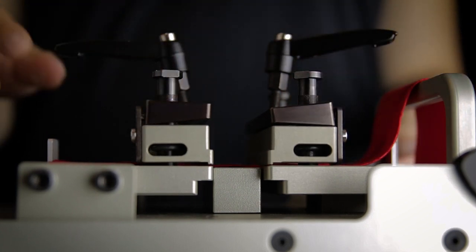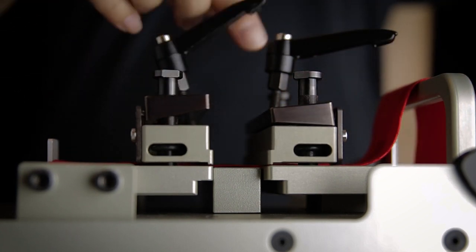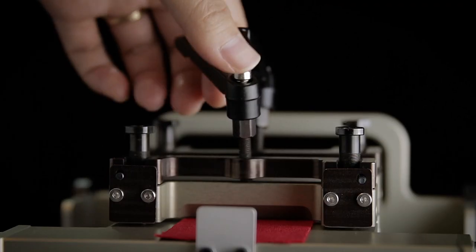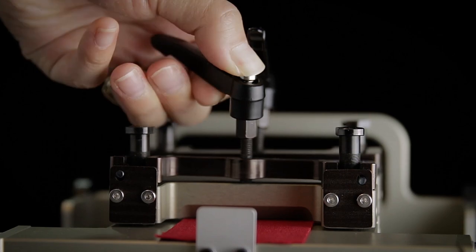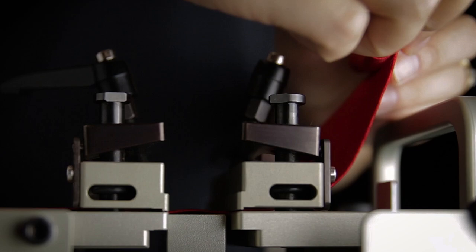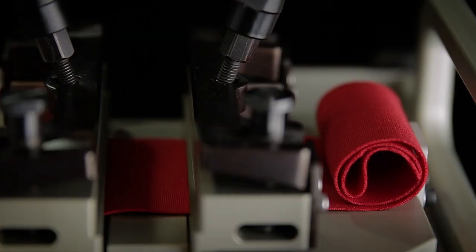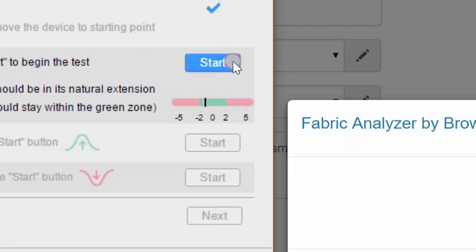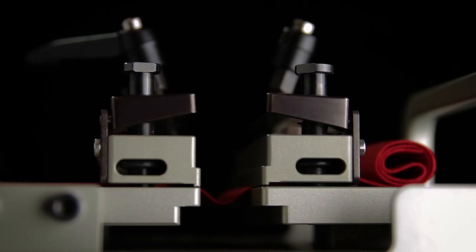In some cases, the fabric may not reach the stopper. This is okay. The main priority is to test a portion of the sample fabric that has not been tested in the previous test. Lower the clamps and wind the tightening knobs. If one tightening knob's path is blocked by the other, simply press down on the top of the tightening knob and rotate it out of the way. Once again, make sure that the force indicator appears in the green zone. Fold or roll the excess fabric so it lays near the stopper on the fixed arm. Remove the small spacer. Hit Start and the movable arm will move just slightly to prepare for phase 1 of the test.